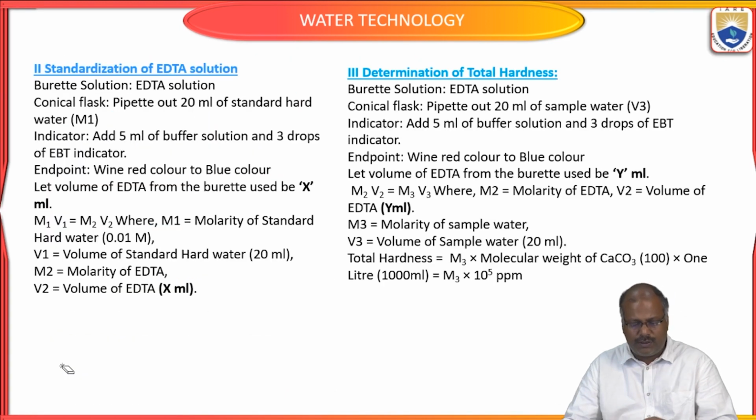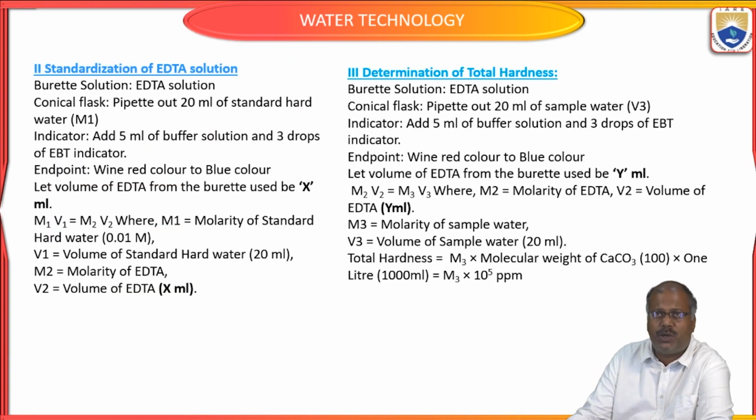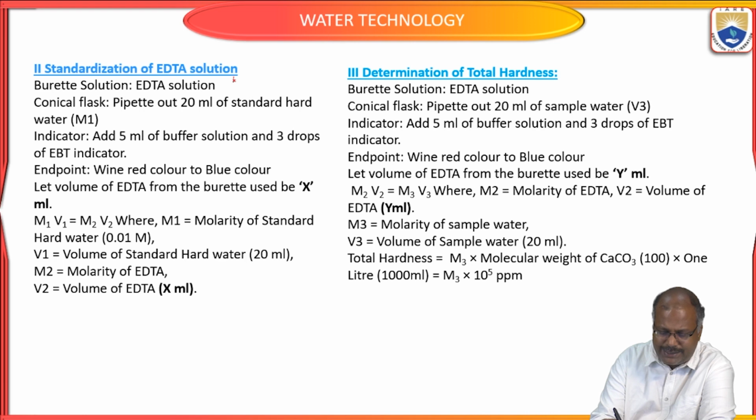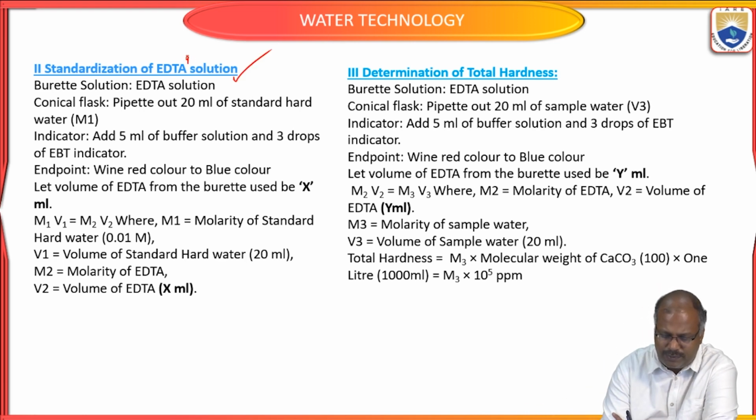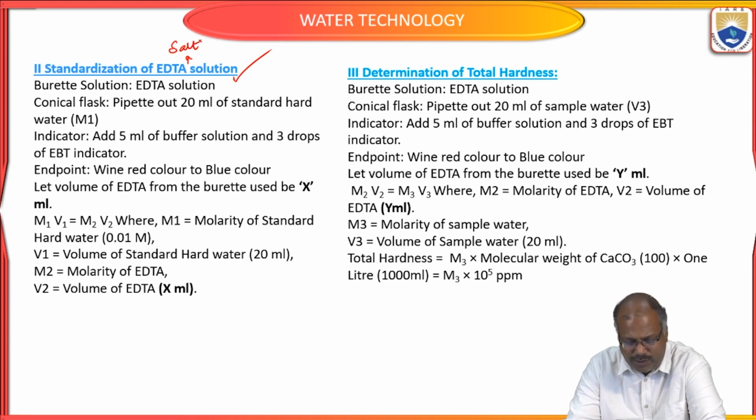Next step. So first step is preparation of solution. Second step is standardization of EDTA salt solution, disodium salt of EDTA solution.